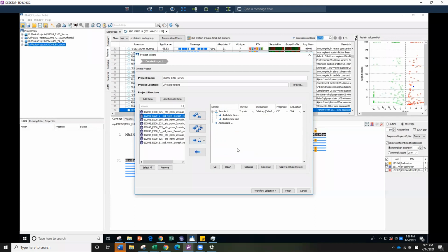So you will find it's a lot easier to just organize it right now than later. I'm having a guanidine concentration curve from 0 to 6. So I start from 0 and you'll use this button to push every sample. If you use this one, the samples will be pushed in individually as 2 samples. So now I'm going to move it back.